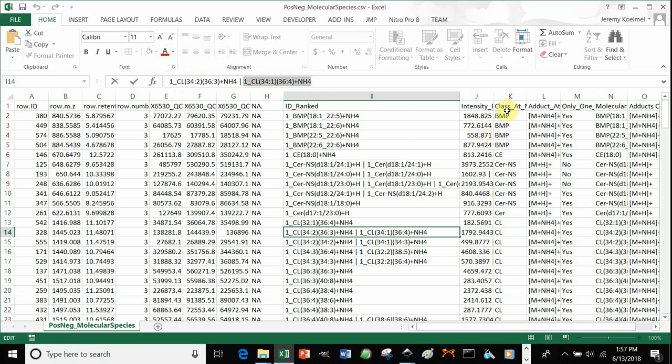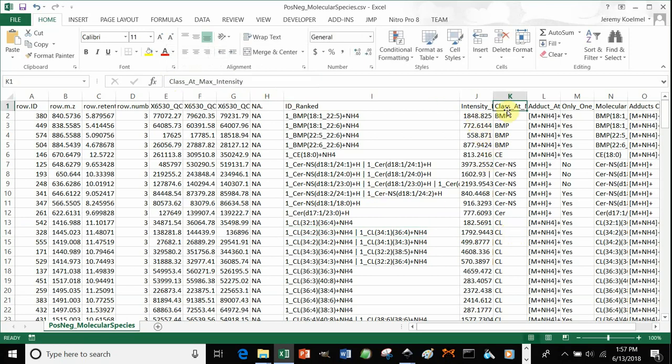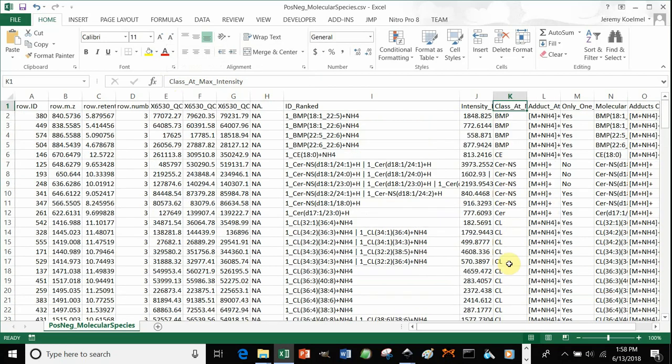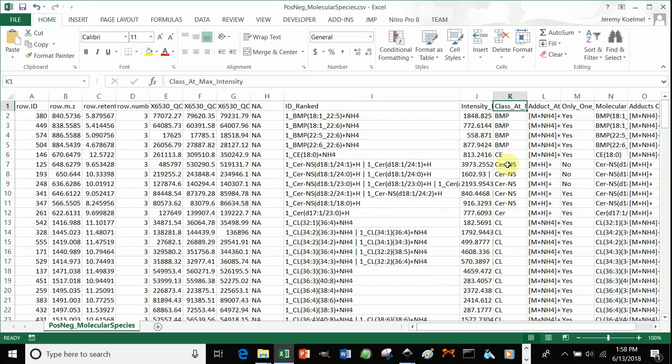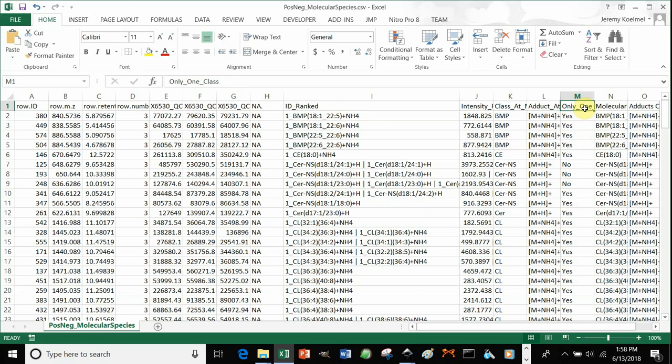In addition, we can see just the class. So if you want to do some class-based statistics, you have a column of just the lipid classes. The adduct at maximum intensity, so what was the first hit? Same thing for class. And then whether only one class or multiple classes were observed.